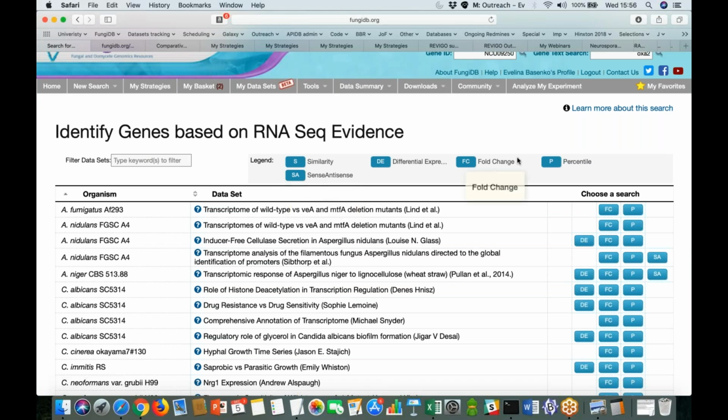The last search that I will actually demo during the presentation is a fold change search, and this is essentially a pairwise comparison of the RNA-Seq expression data, where I use the FPKM values reported for the dataset and look, for example, at upregulated genes 2 or more fold when compared to the reference sample. Okay, so this is just a brief overview of what these searches do.